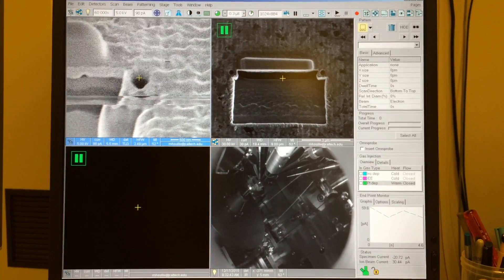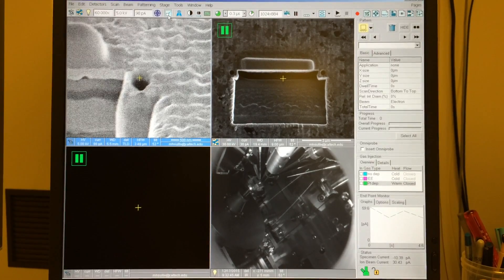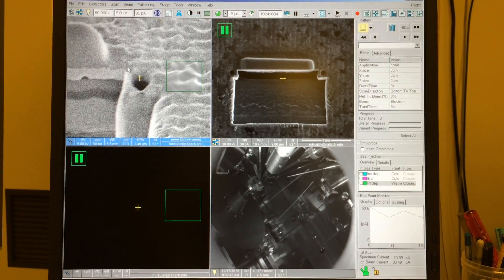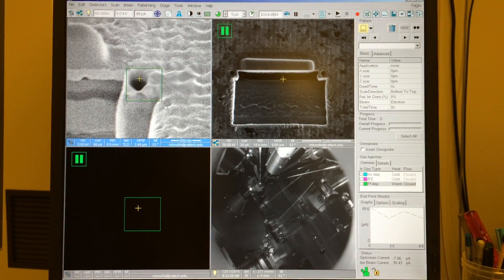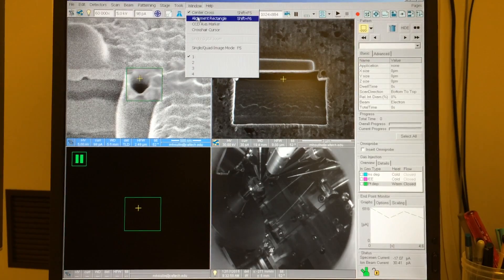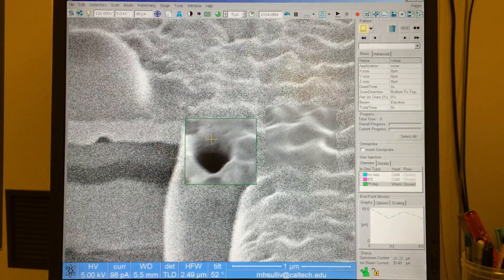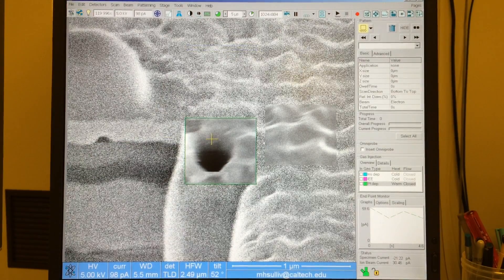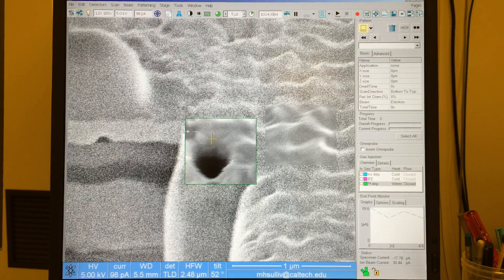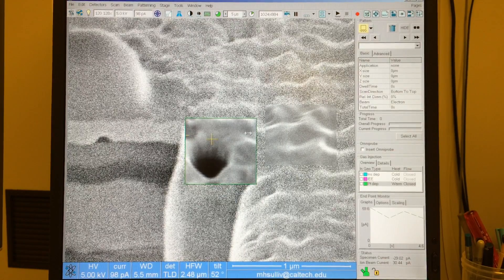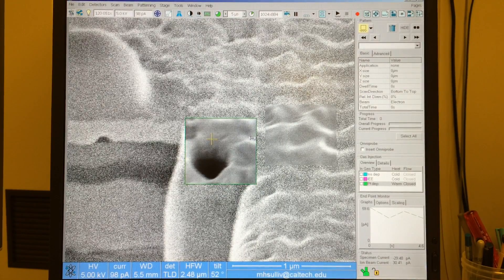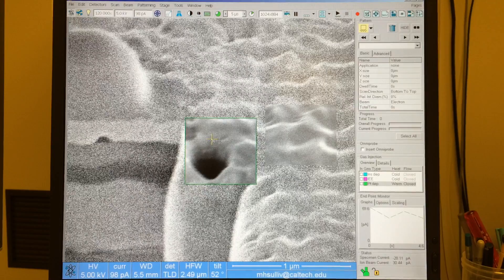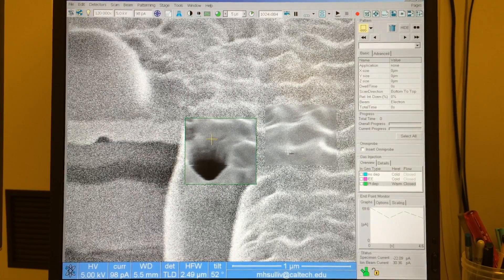So here's one of those circles that I milled using a reduced window. I'll put that around the circle, and I'm going to go into full-screen mode and adjust the focus. I can see some stretching there, so I have astigmatism, and I'll adjust the astigmatism.